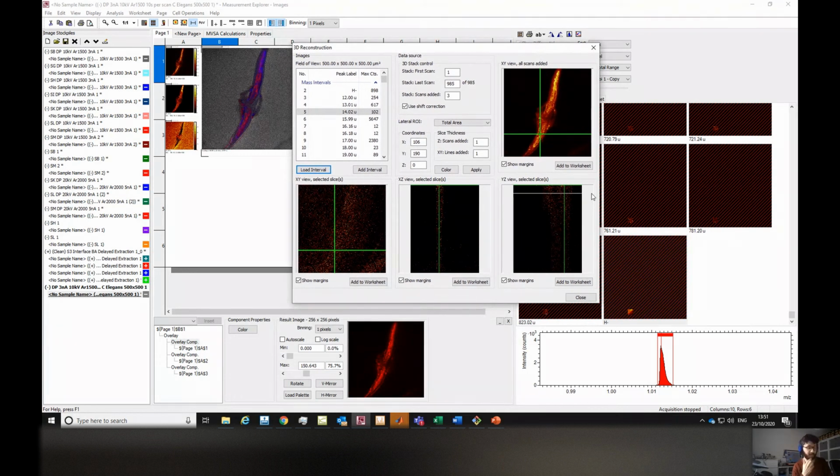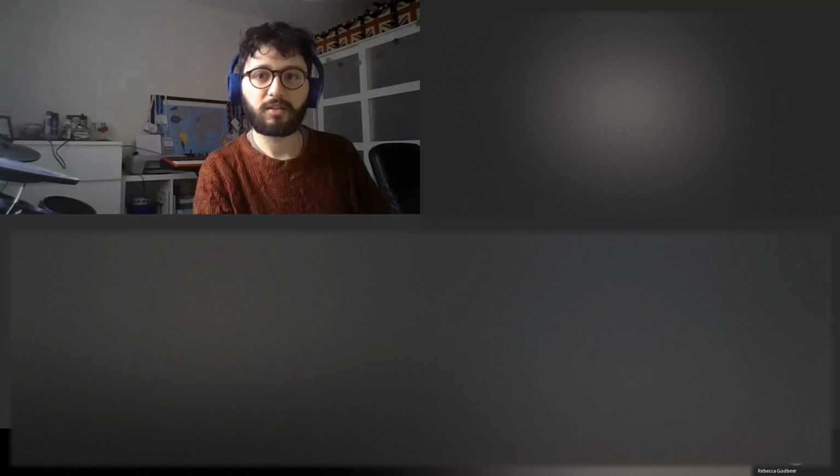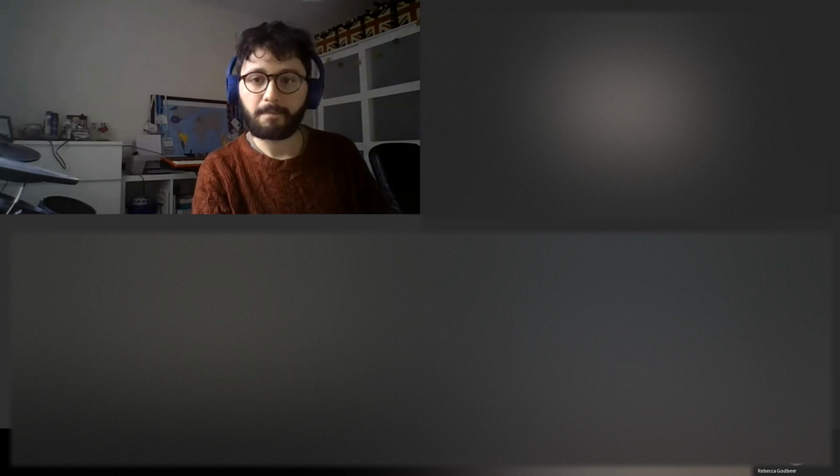Okay, thank you. Let's stop sharing this. Am I still sharing the screen? I'm not sharing the screen anymore, am I? No, you're not. Okay. So yeah, do we have any other questions?